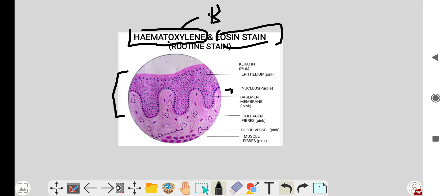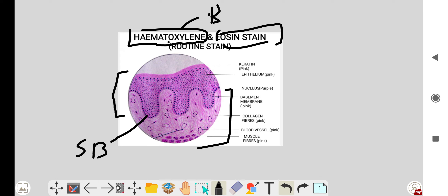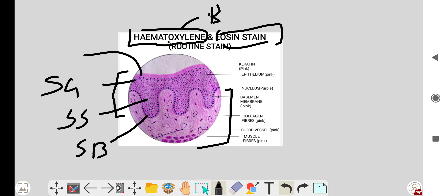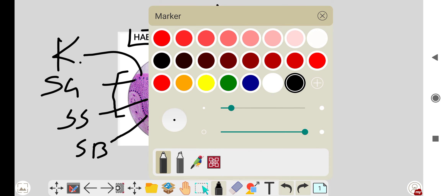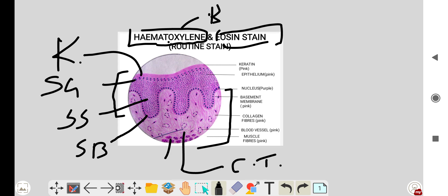This is the epithelium and this part is connective tissue. The epithelium has the stratum basale, which is the basal layer, then the stratum spinosum, stratum granulosum, and the keratin part of the epithelium. The connective tissue has blood vessels, numerous collagen fibers, fibroblasts, and some muscles.